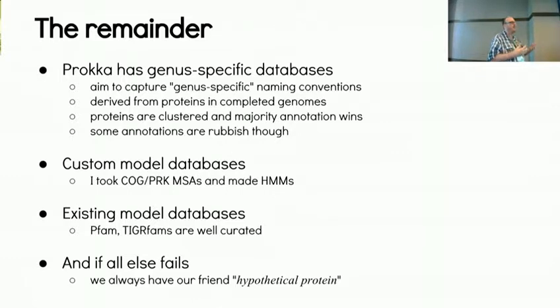It's like they have their own language for that set of genes. It's normally a historical thing, but if you give them a generic name for their gene, they sometimes get a bit upset, because they're so used to seeing their particular name. So you want to try and make it domain specific and might create a custom database to use. We go through all this stuff, and if we don't find anything we can trust, we just call it a hypothetical protein.